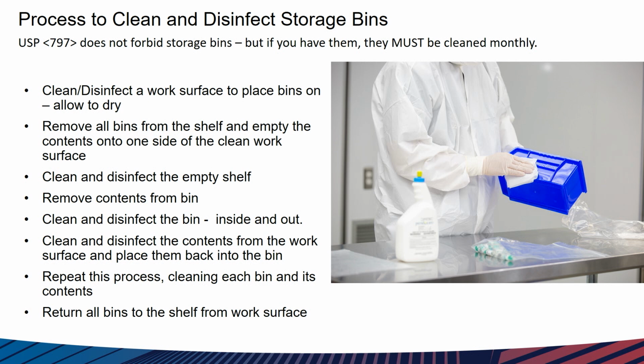Again, USP does not forbid you from storing anything in your clean room, but anything that's in there must be cleaned monthly. So can you store some of that stuff outside and only bring in what you're going to need for that day's work? That's probably a better practice for you to follow.